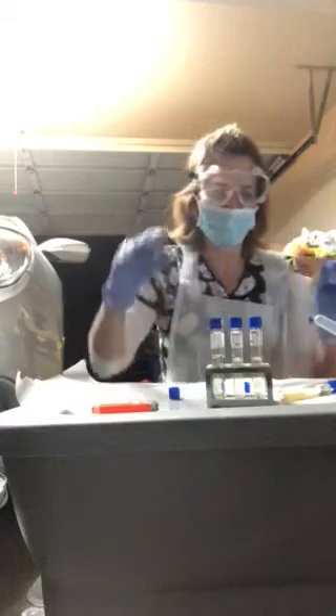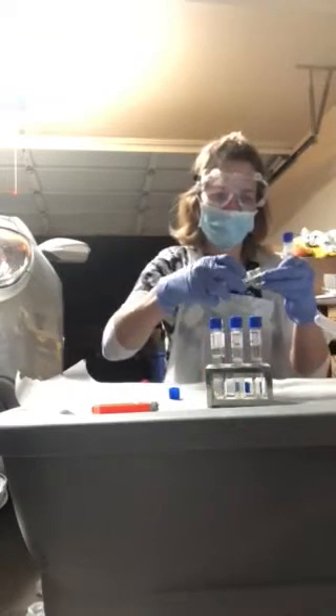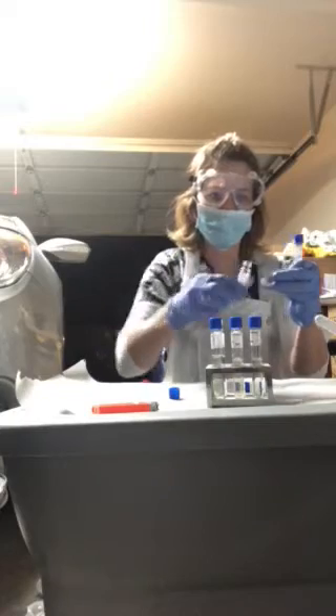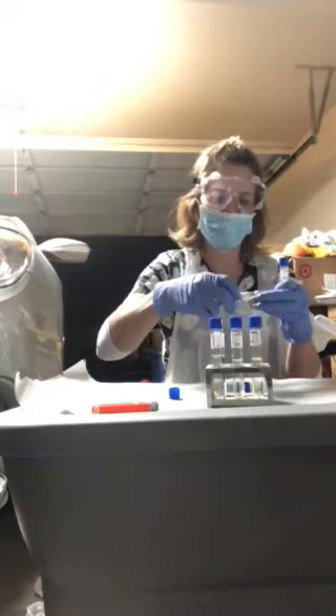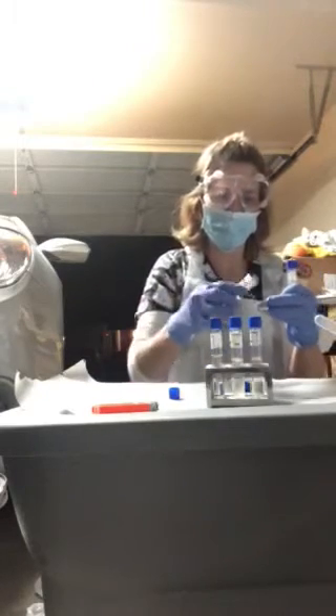I'm going to do my sterilization really quick on my vials.